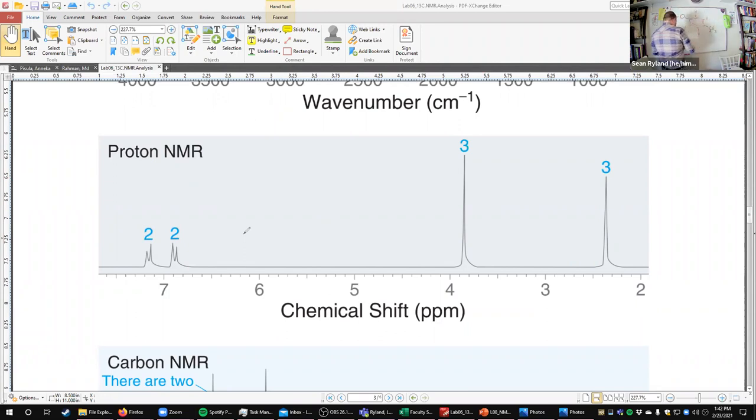So we can still do protons on A. And so our lettering kind of still works. C and C, nothing there, nothing on the oxygen. So we should only have four distinct peaks, which is what we see. And we're going to go through this and do things pretty much the same way. Our logic still applies, just like it did for the carbon one. So the peak that's the most shielded, furthest to the right, is going to be A.